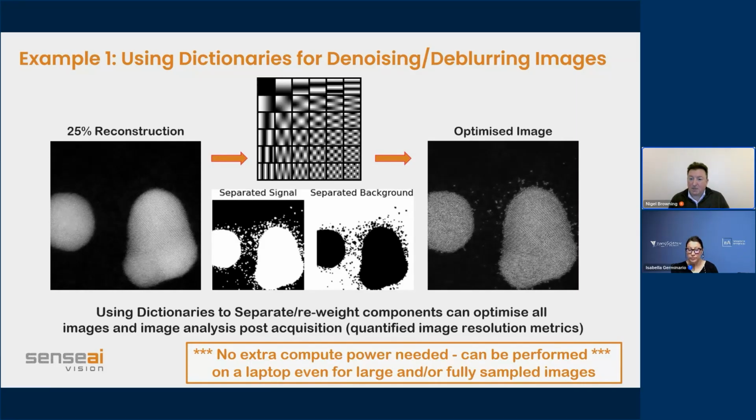And that's where I say that if we stay at 10% and above in terms of the subsampling, we know from all of our ground truth experiments that we have done that we're going to have a level of uncertainty in the image that means that a human cannot really see the difference between the reconstructed image and the ground truth image. Now, mathematically, the PSNR still has several levels to go.